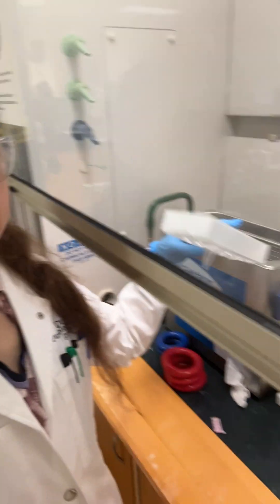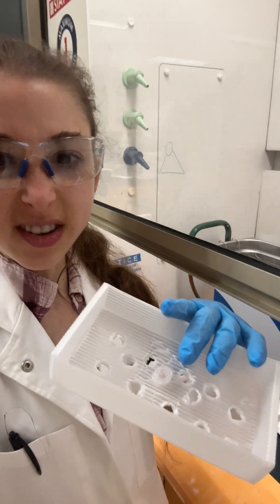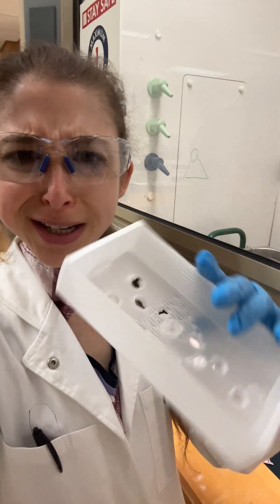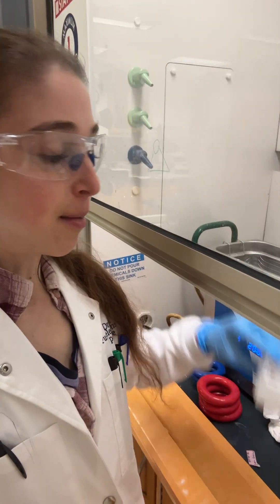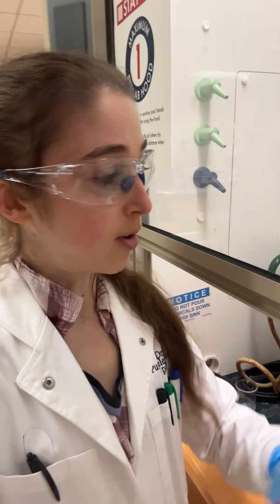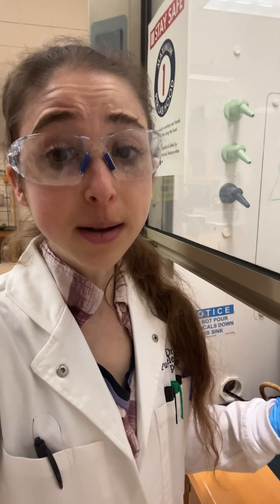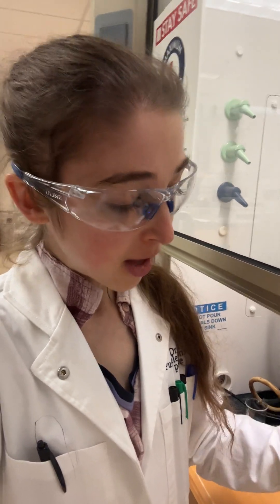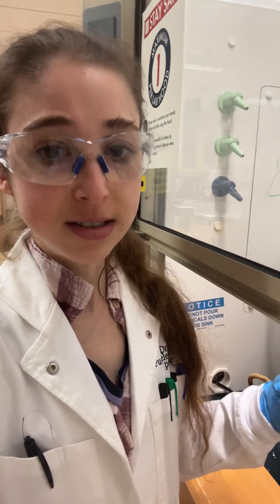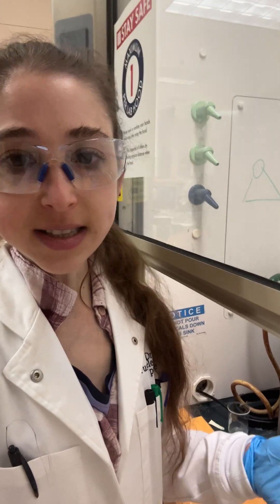For a bath sonicator, depending on the size of your samples — if you have a little Eppendorf tube, stick it in some sort of floaty. We made a makeshift one out of a box lid, but they make foam floaties for Eppendorf tubes. For bigger containers, use a weight to hold it down. Sometimes a short sonication is all you need; sometimes you might need a few minutes or longer. It can get warm, so if your sample is sensitive to heat, keep that in mind — you can get temperature-controlled ones or take breaks between sonications.